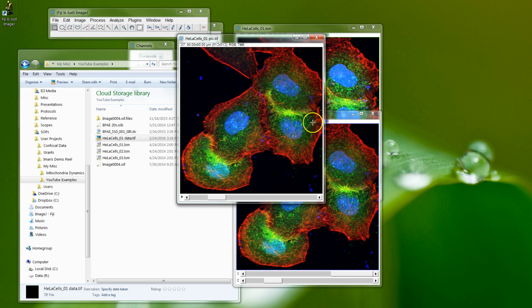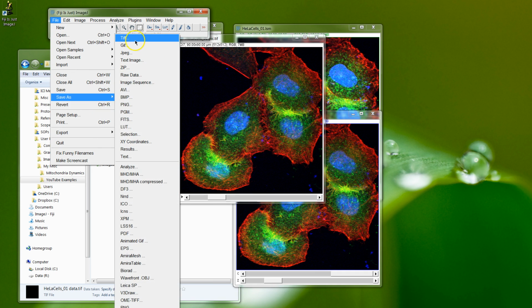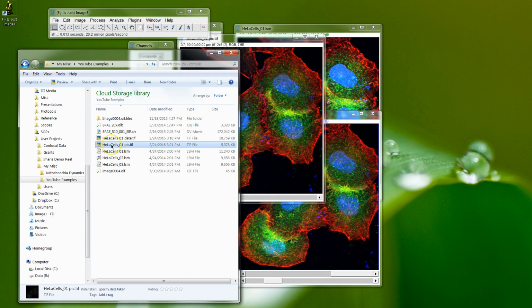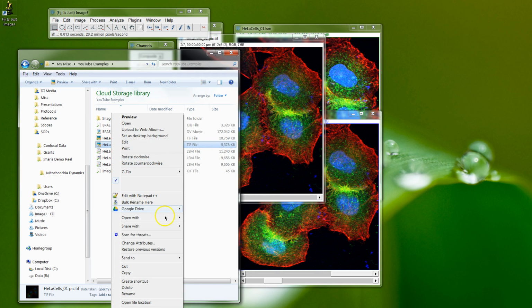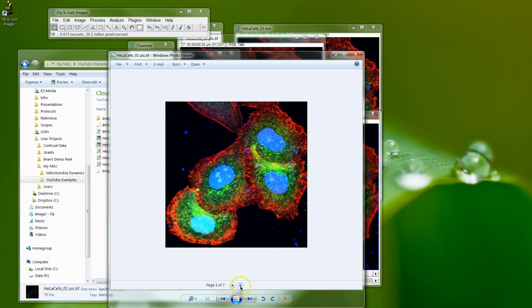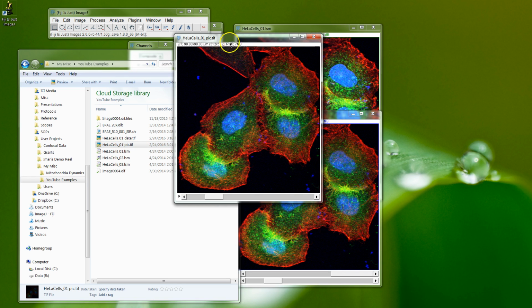And so there's our picture format, and I can save that as a picture TIFF, and just save as TIFF. And then when I try and open that with Windows, open with the standard viewer, you'll get multiple layers. Now it's got 7 layers, and each one is a picture, and you can see it as it was displayed. And I could always just save that one layer that I wanted.